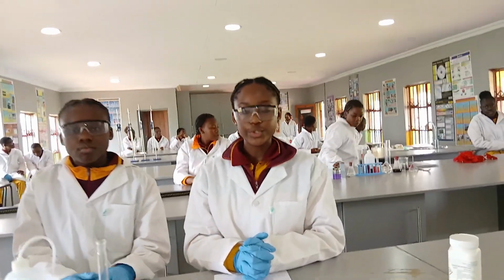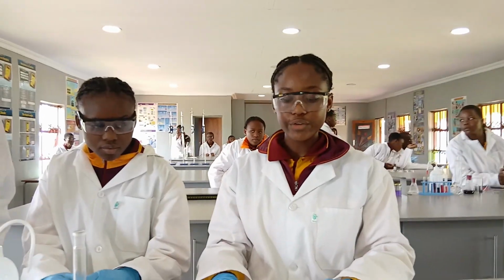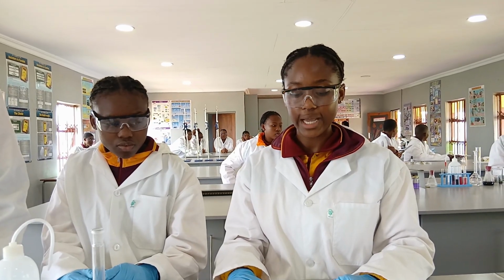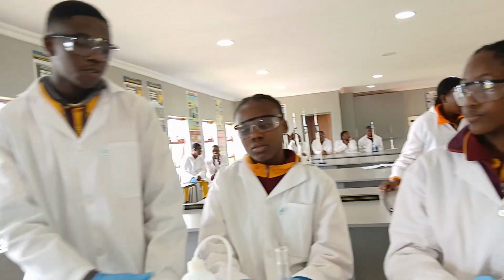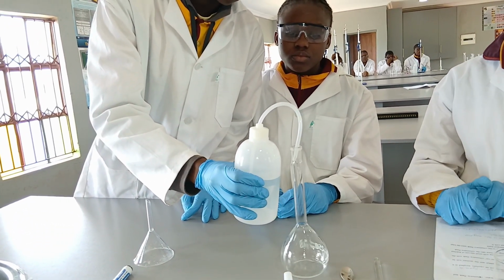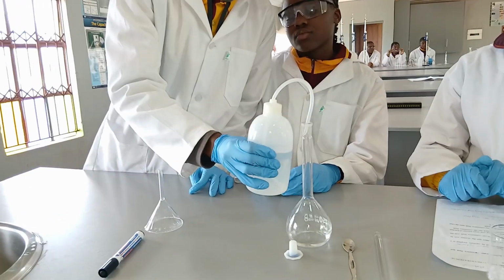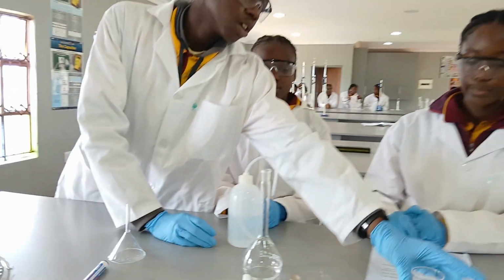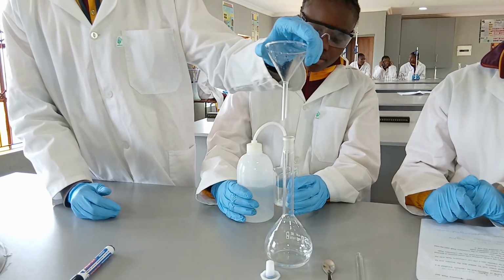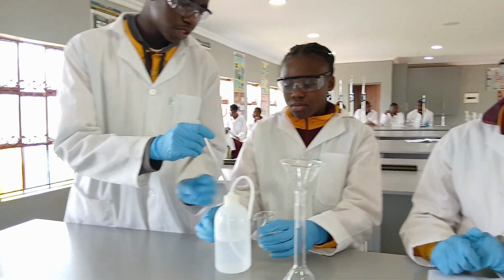After we have weighed the sodium hydroxide in a beaker using a weighing balance, a small amount of distilled water will be added and the mixture will be stirred for the sodium hydroxide to dissolve. First we need to add a little distilled water into our volumetric flask before we add our solute. Kindly pour this. Now you need to stir.